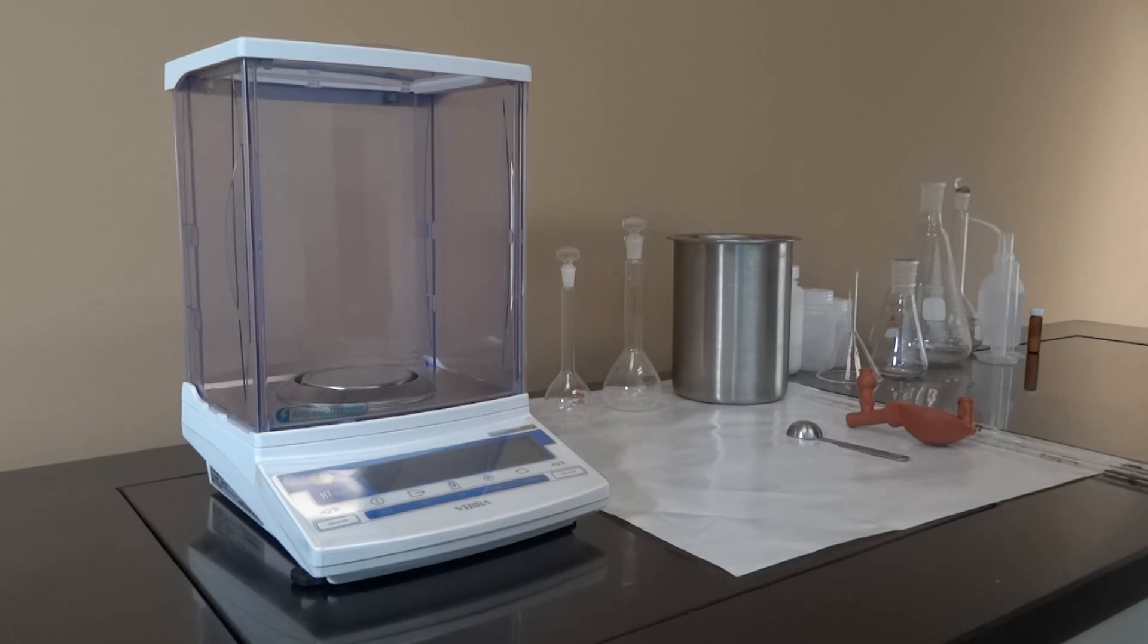Simple, stable, and efficient. The HT and HT224R are excellent balances for analytical weighing, allowing for a flexible workflow in a laboratory environment.